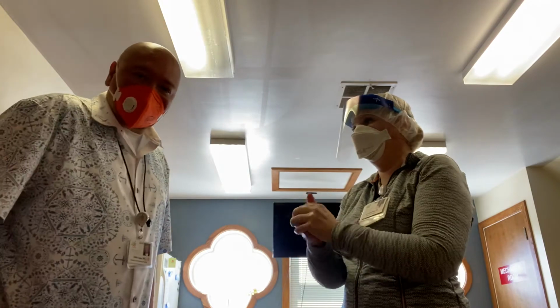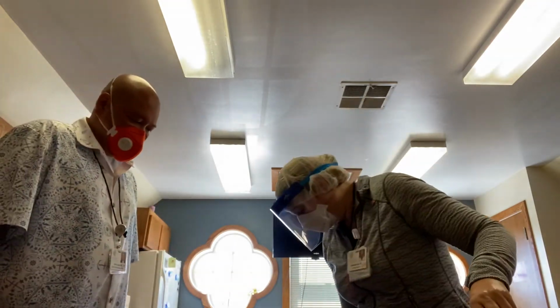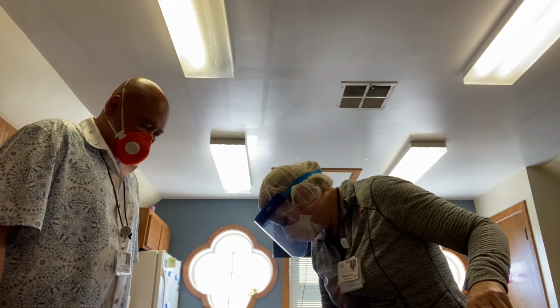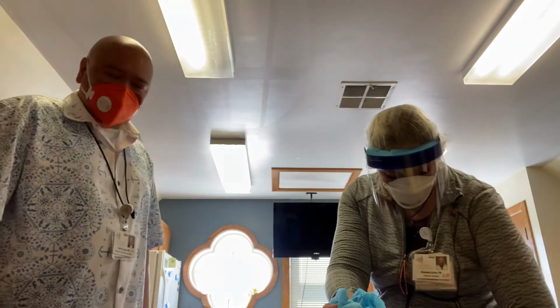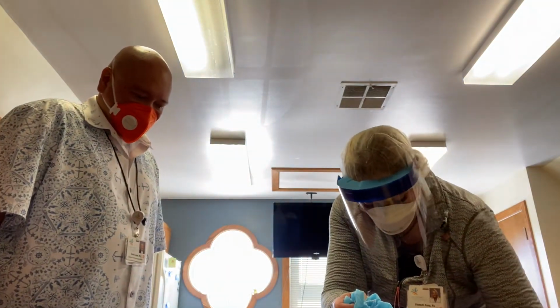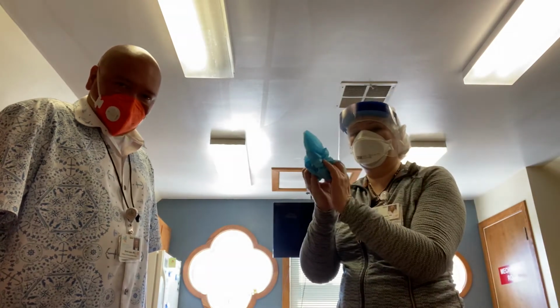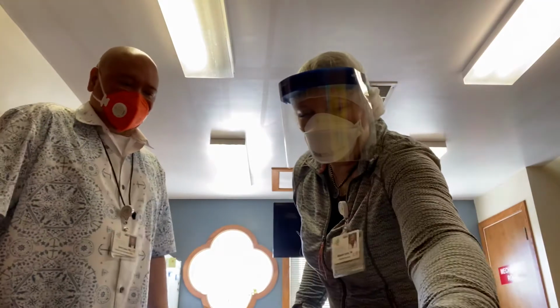Then the next step is to remove the shoe covers. And also with those, you only touch the inside, not the outside. Same process. So you stick your finger on the inside and roll it across itself, so you're not touching the outside of the shoe cover. Alright, then sanitize again.